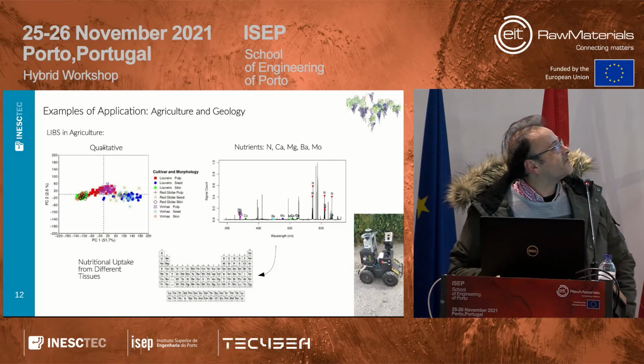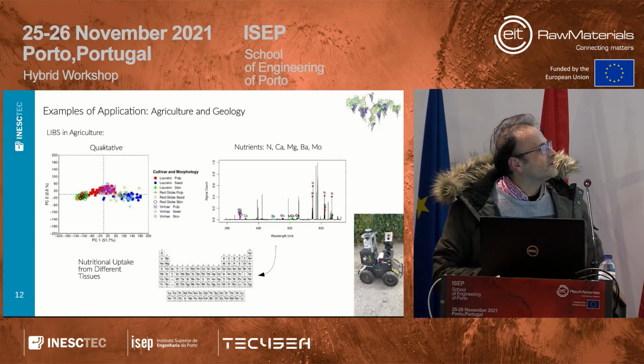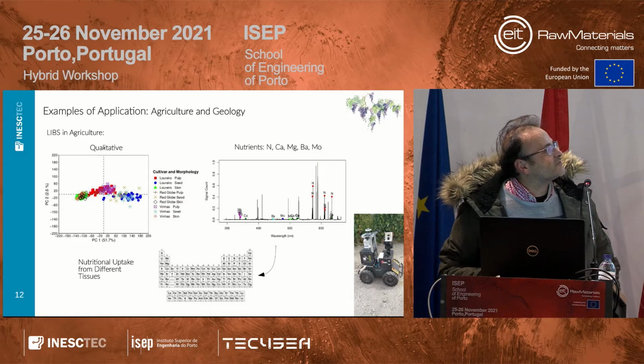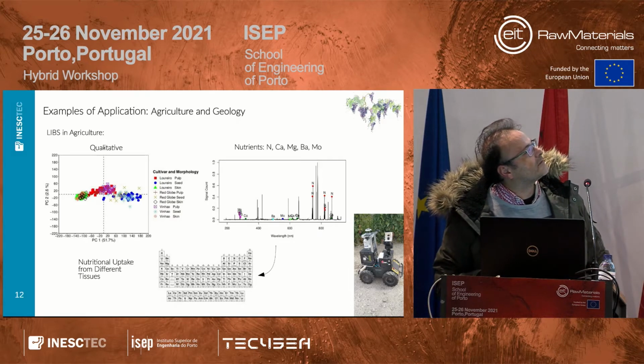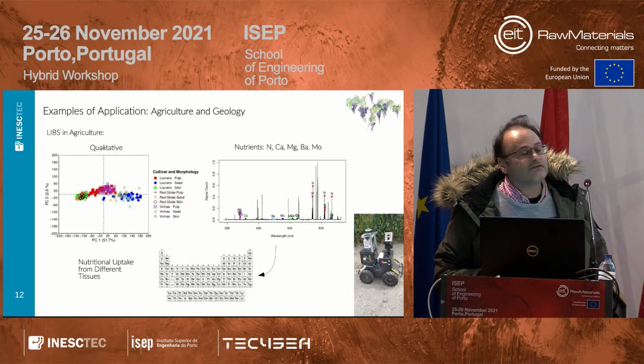For example, we have been using this in that robot that we have here at INESCTEC, and with field, that robot is equipped with spectroscopy, but not LIBS spectroscopy. We took samples to the lab just to make sure that the LIBS is in agreement with other instrumentation that we used in the field.